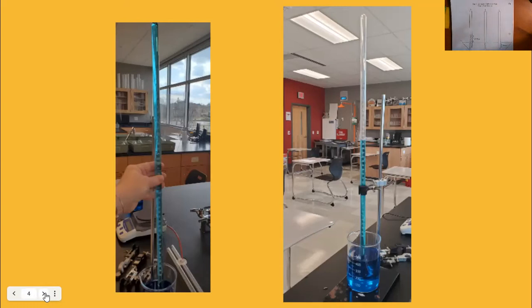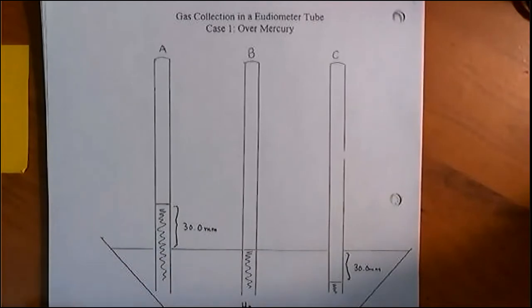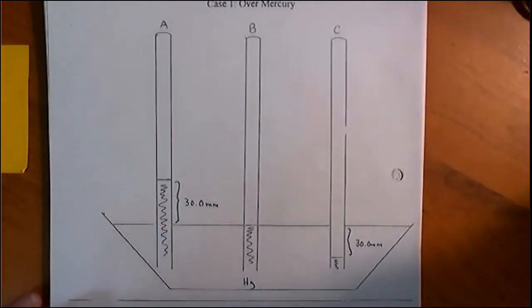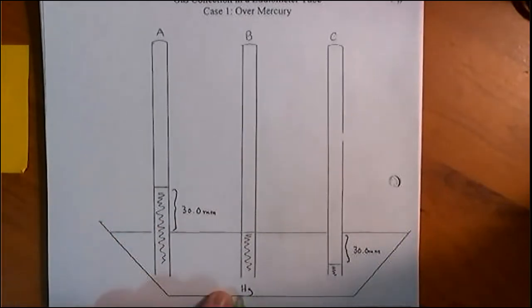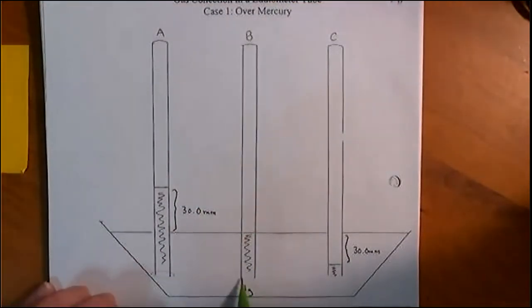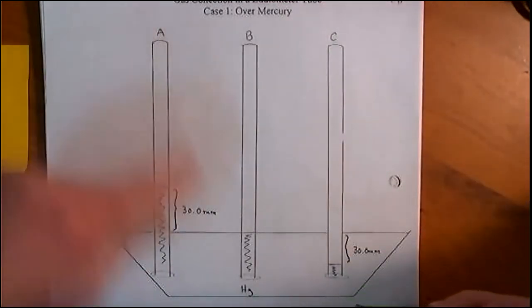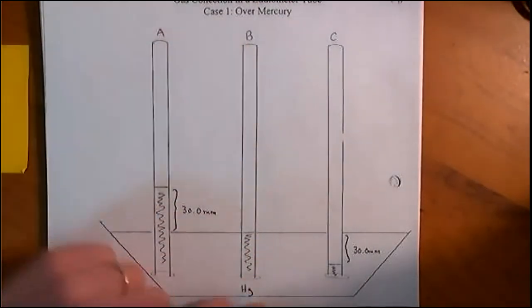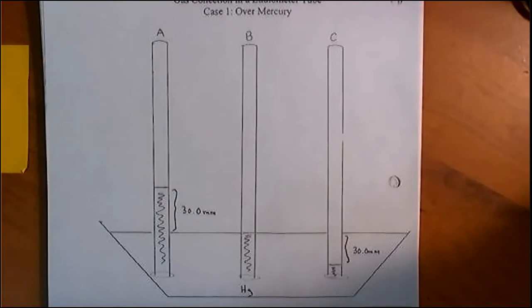Well, now let's transition to the student note packet. What we need to talk about first is we need to apply our imaginations and pretend like we had our green bins filled with liquid mercury. Imagine we have 3 eudiometers. So these would be the opened, very long test tubes, and we filled them completely full with mercury. Then we overturned them, clamped them, and then trapped samples of gas.